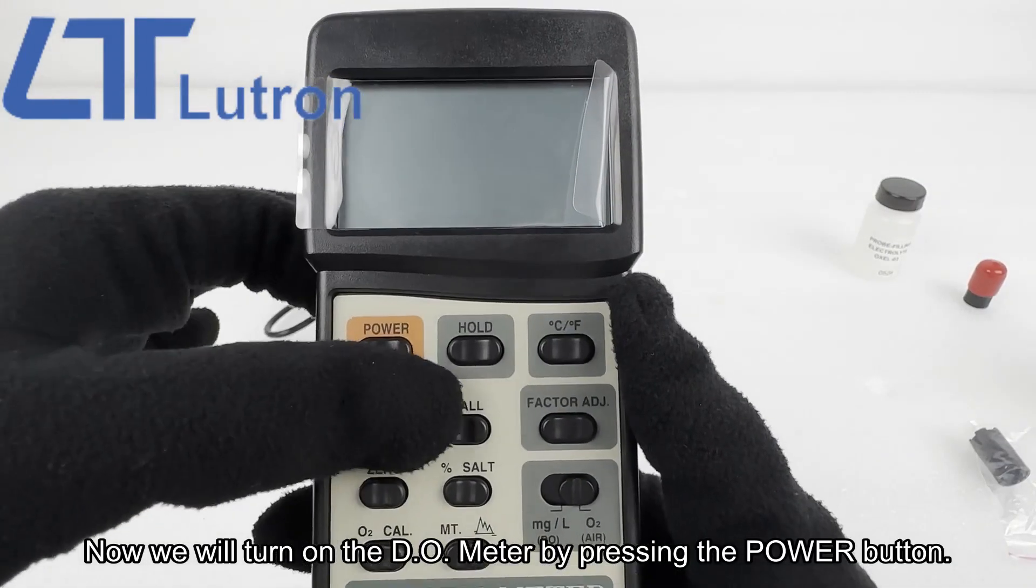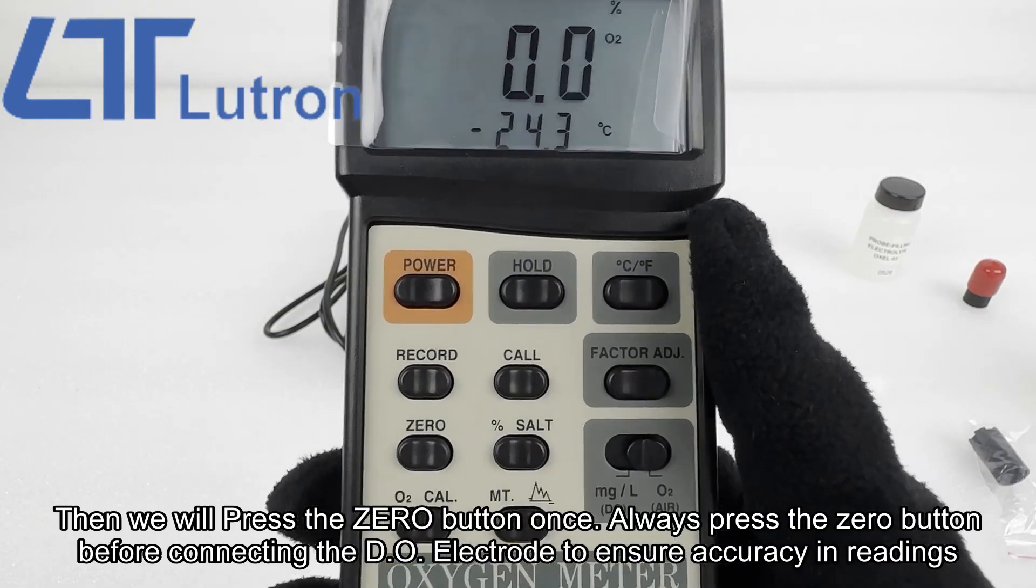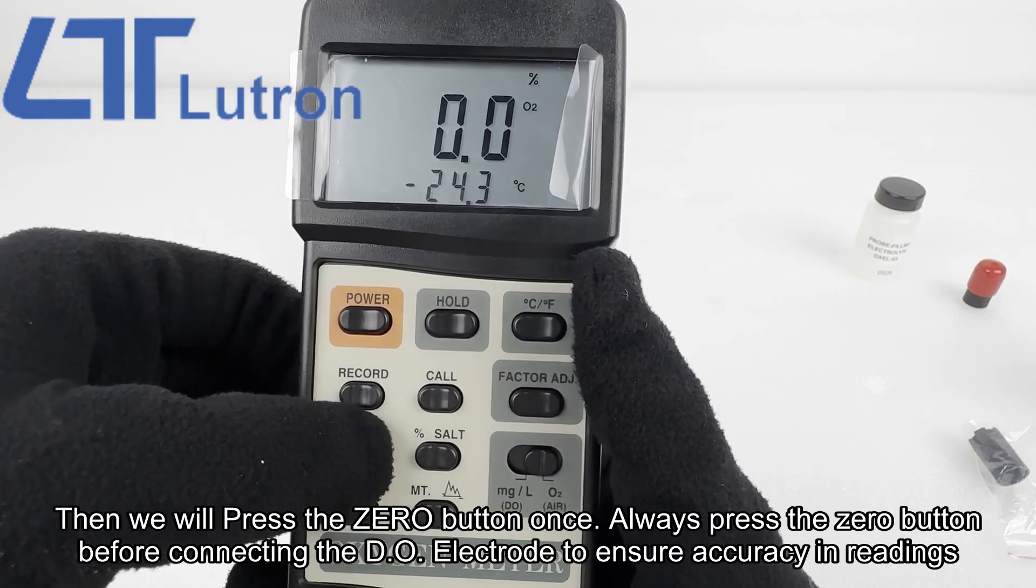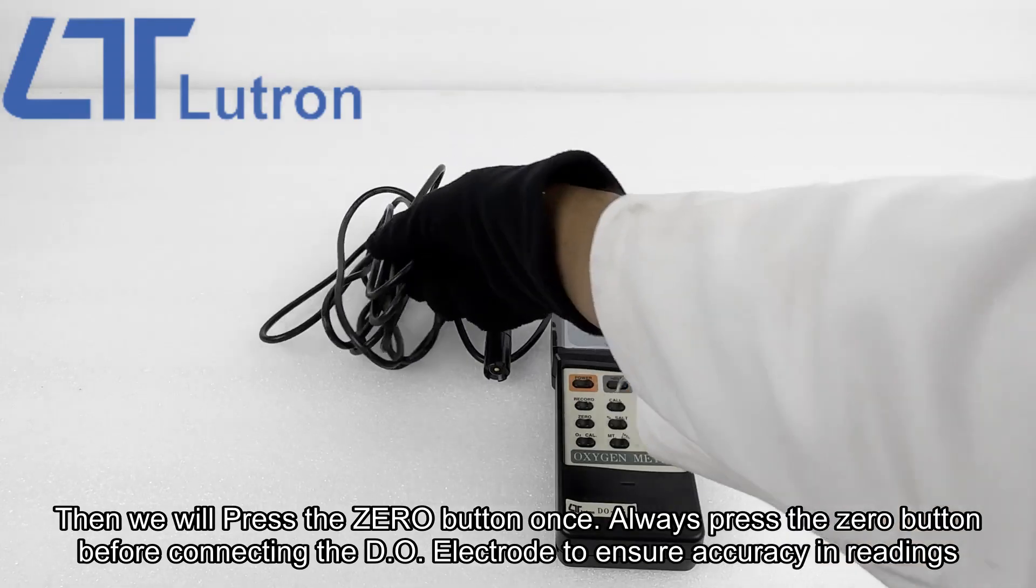Now we will turn on the DO meter by pressing the power button. Then we will press the zero button once. Always press the zero button before connecting the DO electrode to ensure accuracy in readings.